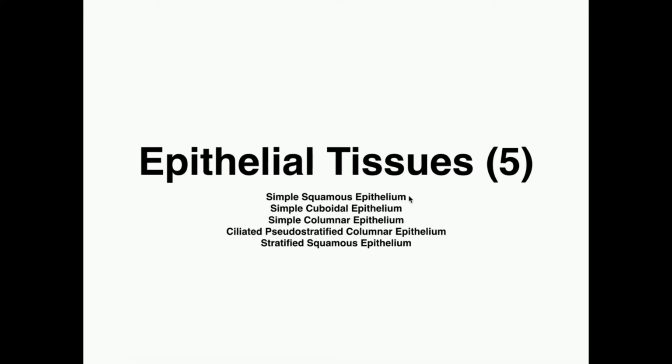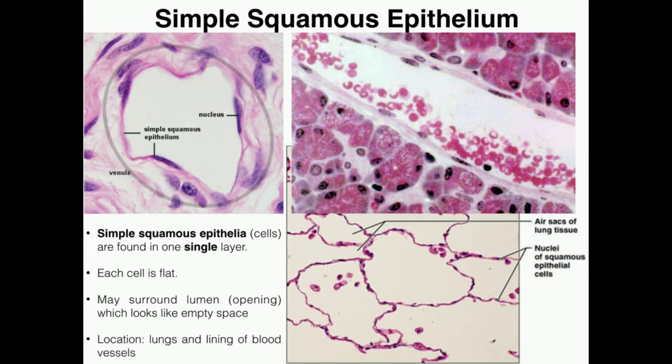And these names right here on this slide, which you have, these are the names that you would need to put on the exam to get full credit. These full names right here. All right, first we have simple squamous epithelium. So these are micrograph images of that.